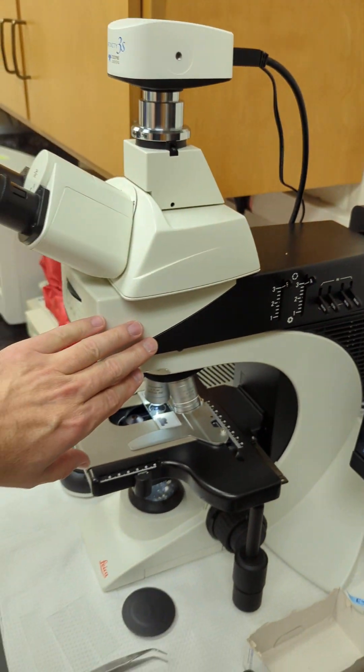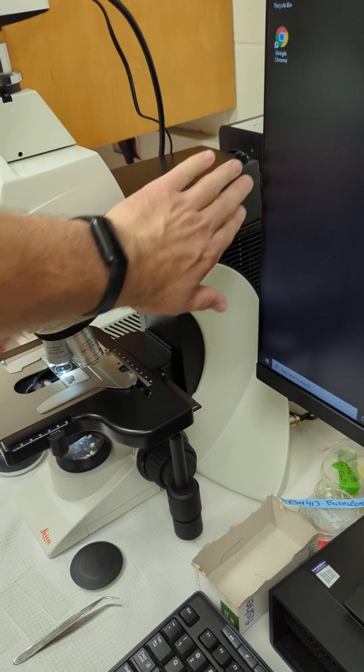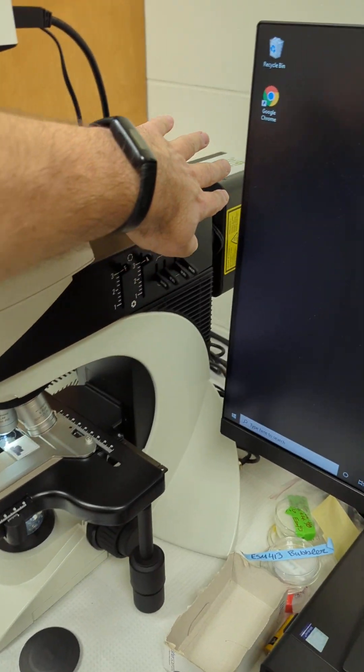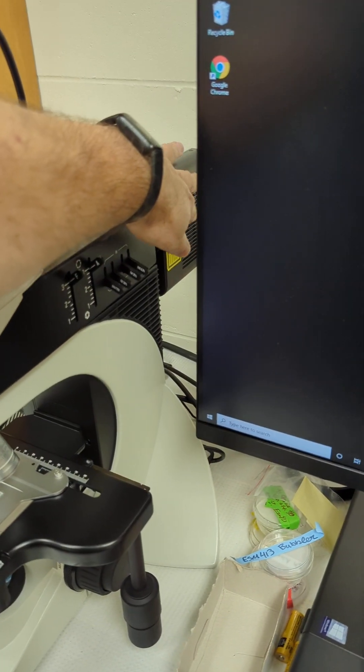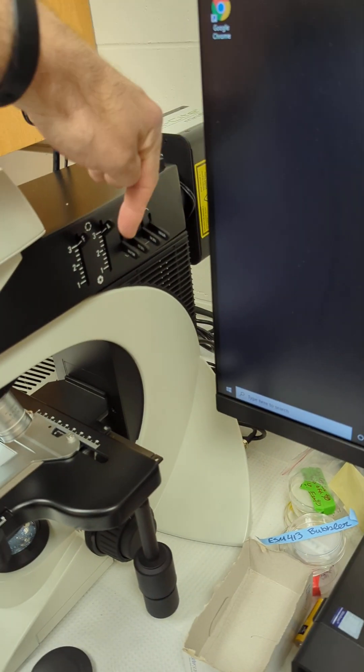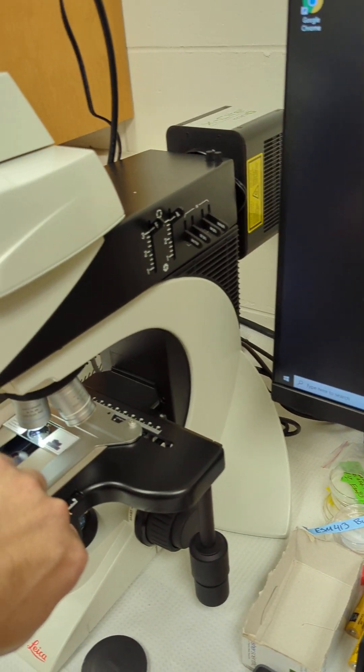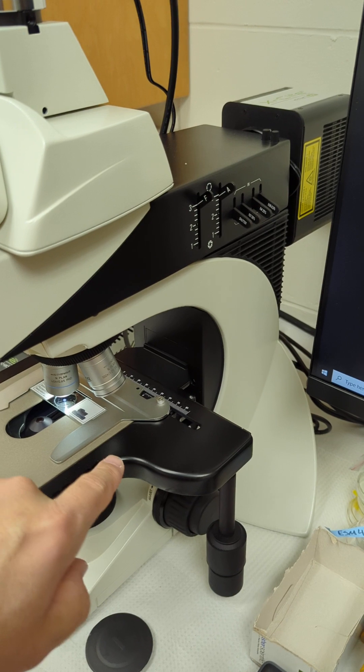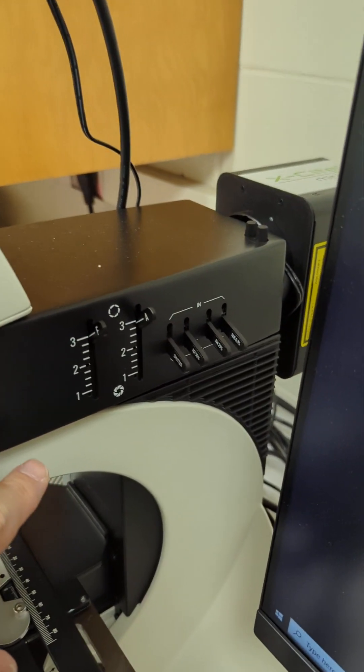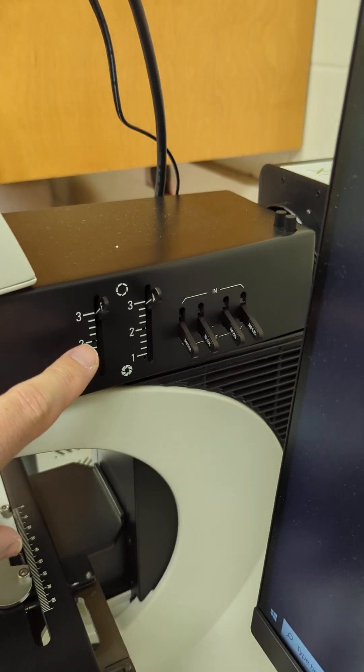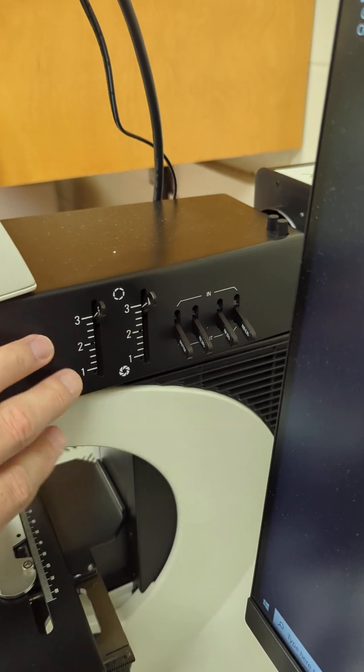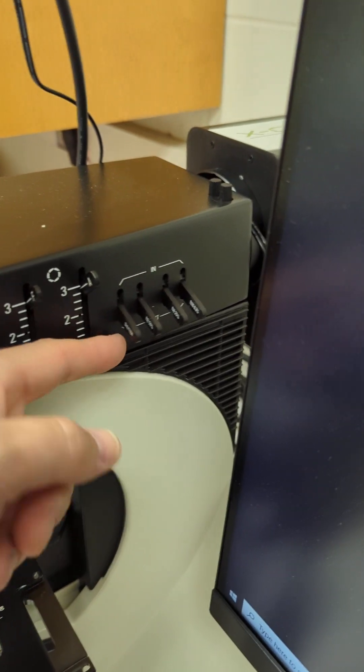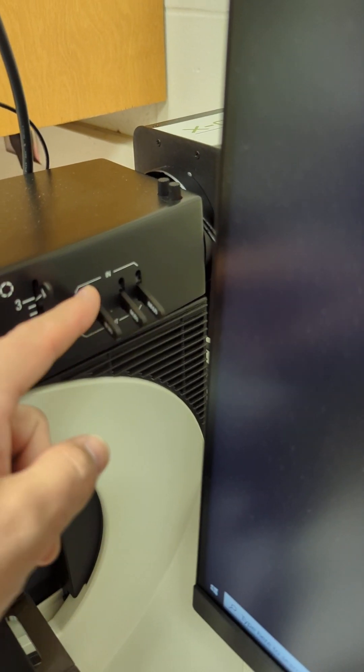Back up to the top again, this is all your fluorescence channel. Your fluorescent light is back here, and it's coming shooting straight through here and then going down the objective. So these are only for your fluorescent light.